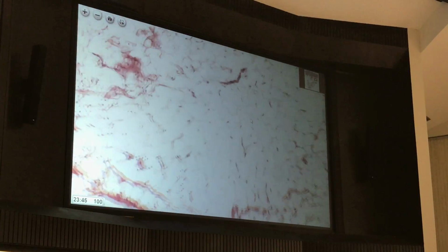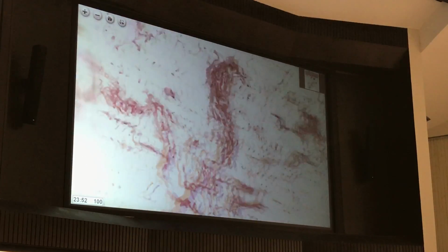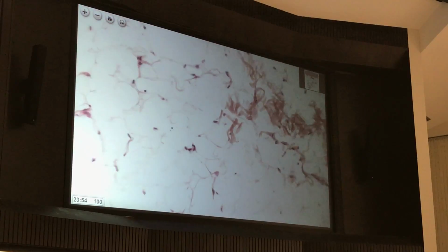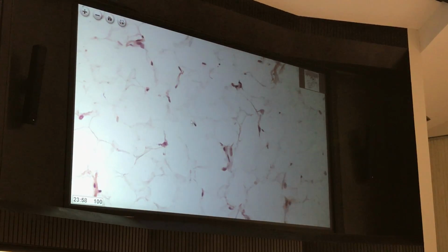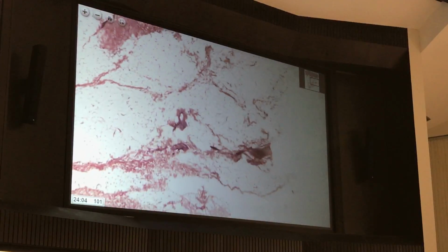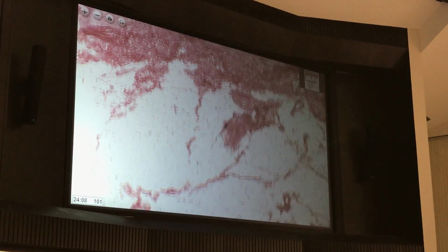What about this tissue? If you had to guess what type of tissue, there's a little patch of it. Adipose, yes. A lot of times it doesn't preserve very well, because the wall is so thin. A lot of them burst apart. But that's what we're seeing here. Those are sheets of adipose tissue.